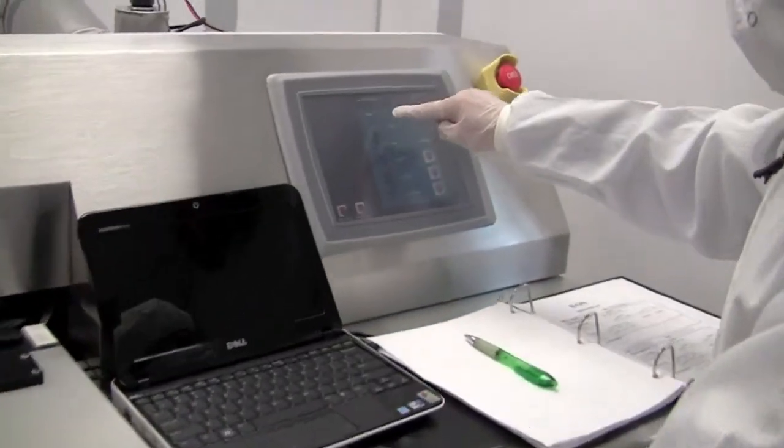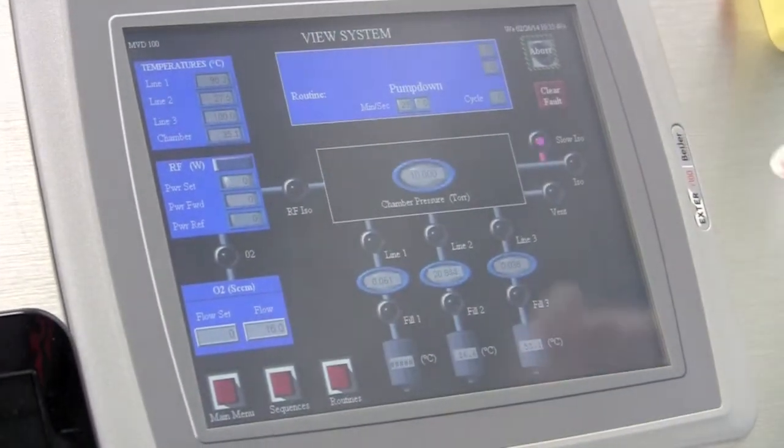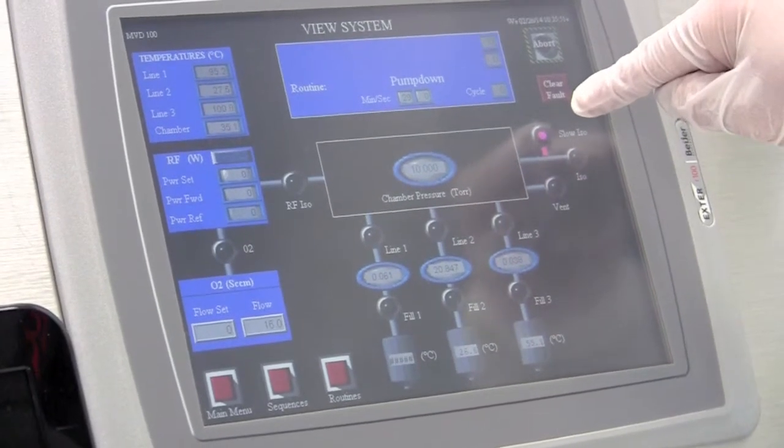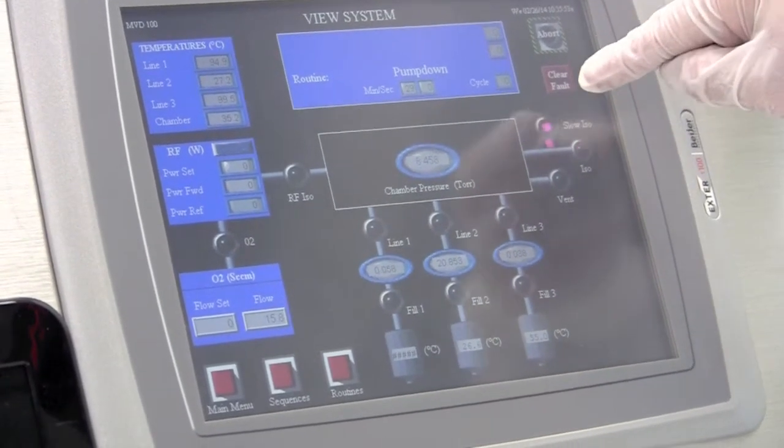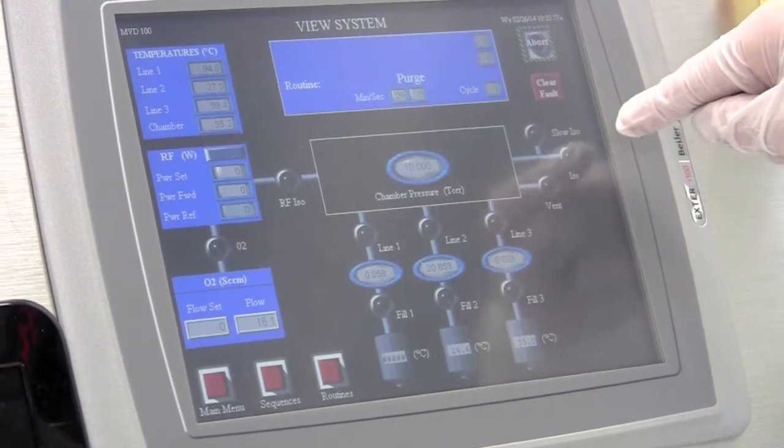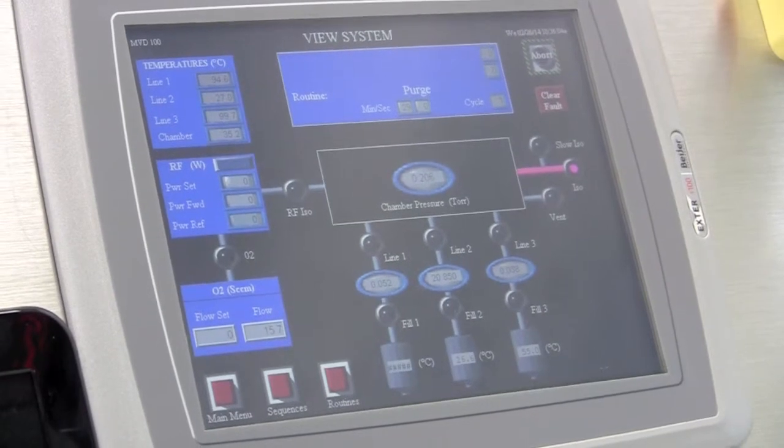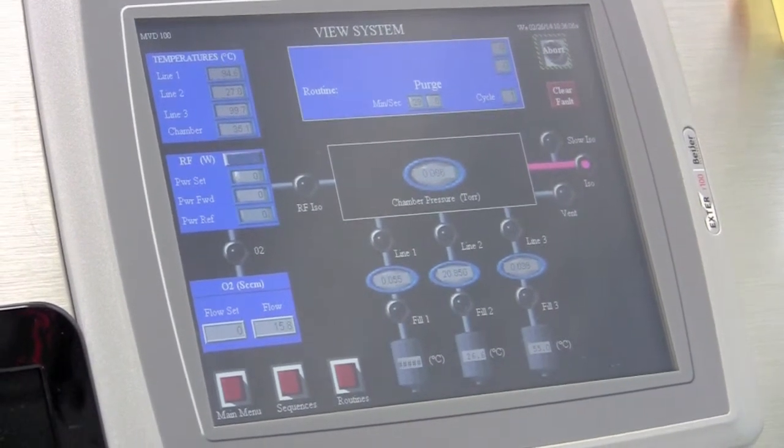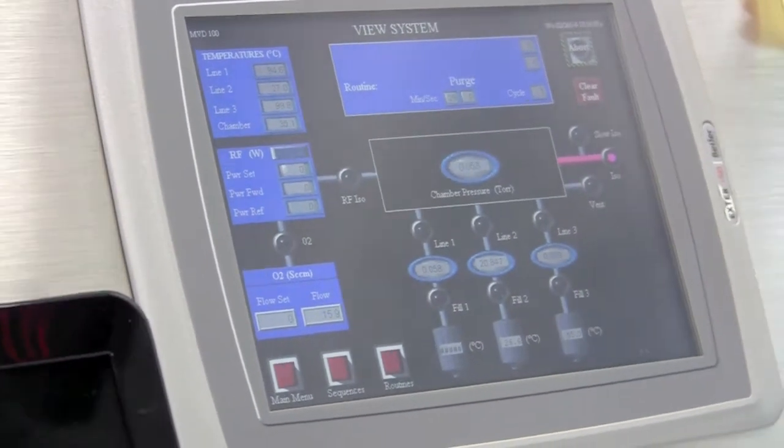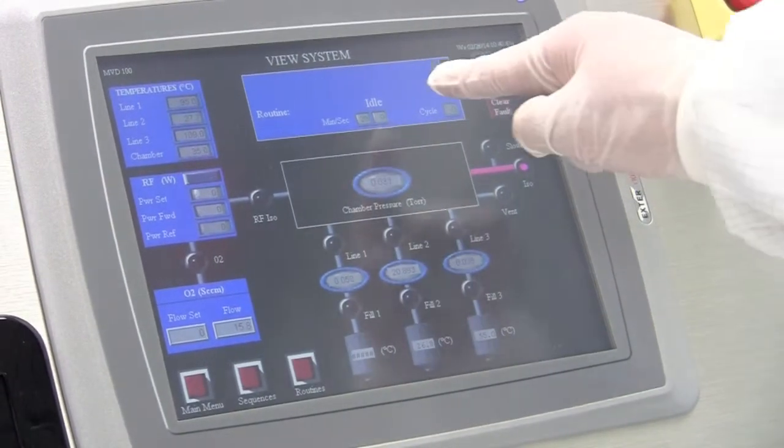Then pump down the chamber by touching this. You see, first you will see the slow ISO valve is open and then closed. Then the ISO valve is open. By doing so, the sample in the chamber won't move. Now we loaded the sample. The system is at idle mode. The next step is to run the sequence.